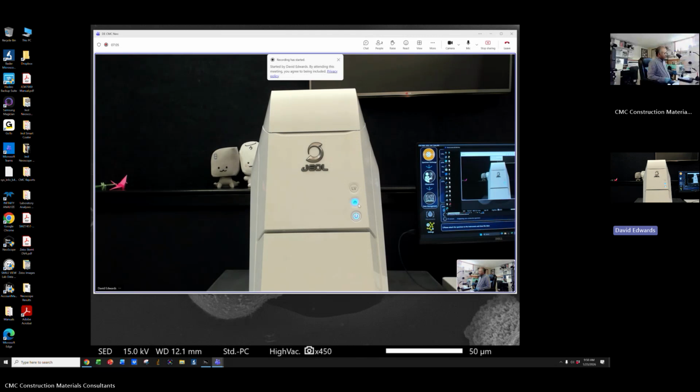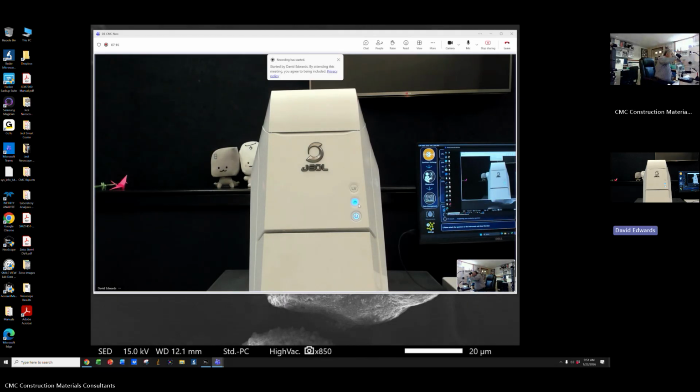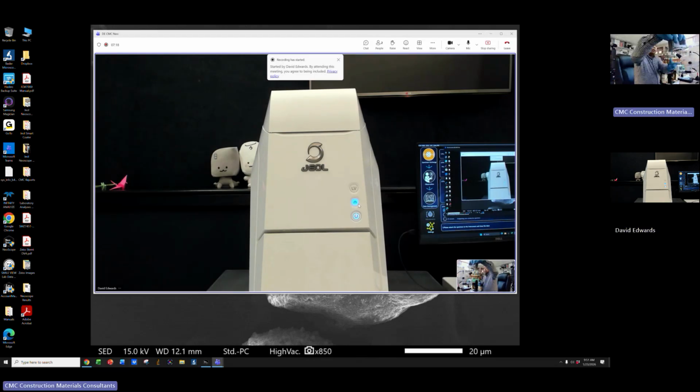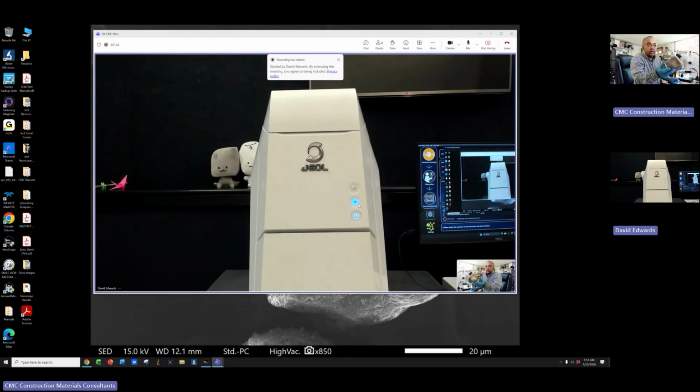So can you show me a top-down picture of your sample? Or take it off and point it at the camera? Okay, take it off and put it in front of your camera. Just like so, to see what the top of it looks like. Oh wow, you can see the marking.